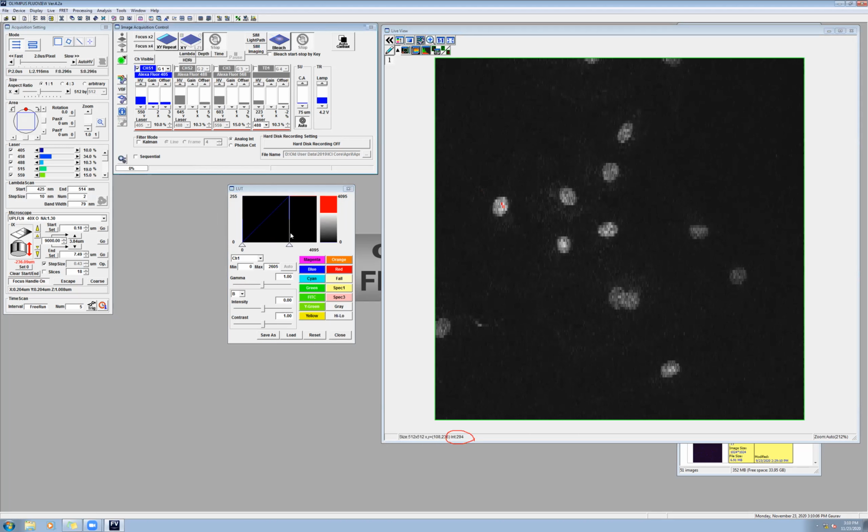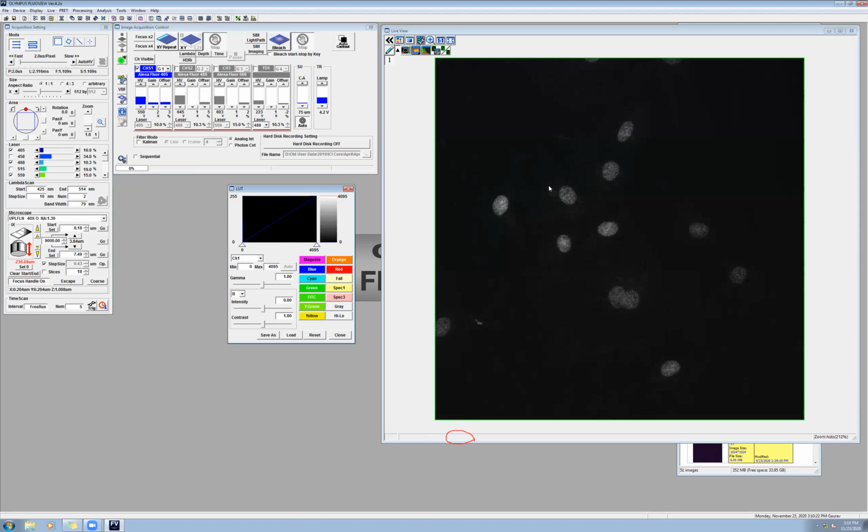We still have this entire range to fill up if we want to. So now we will do focus times 2 and see how it looks, and we will do an XY repeat. Okay, so clearly the image looks a bit better, and I'm happy with what I'm seeing. So I'll keep these image settings the way they are.